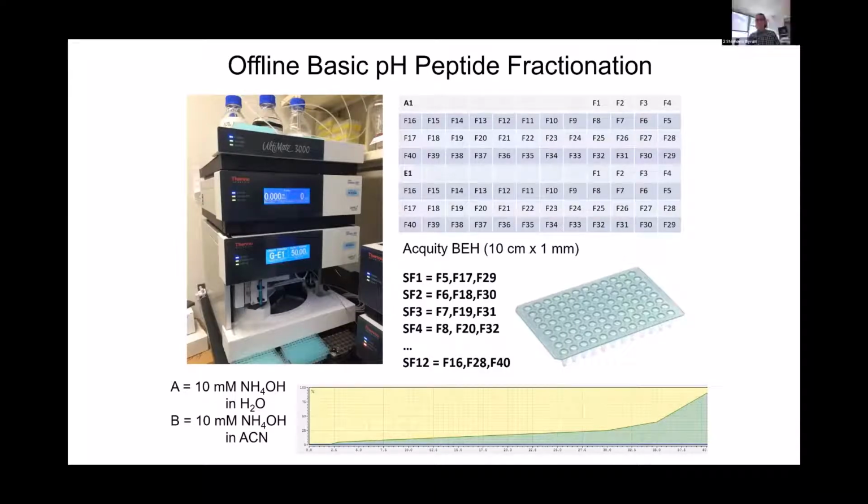Serum, and then we started doing DIA with IP pull down experiments also, and that seems to work really well because again, you're not looking to have 10,000 proteins from a pull down. You want to have that subset.